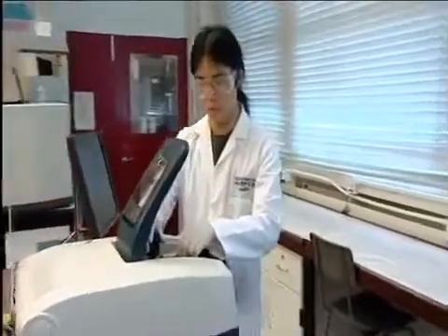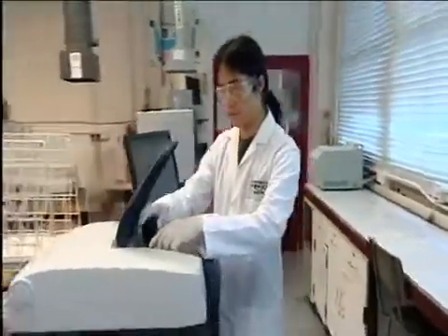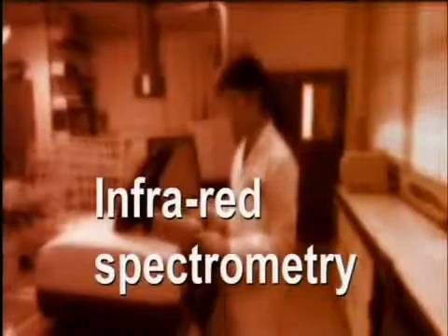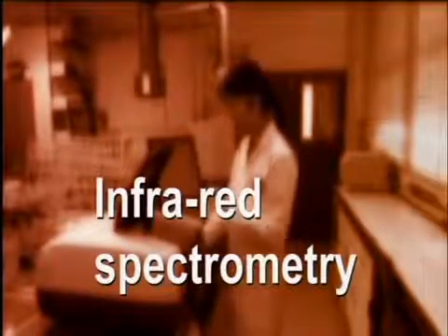Infrared spectrometry helps chemists to identify the functional groups present in a compound. They can therefore help in finding the structure of a compound.